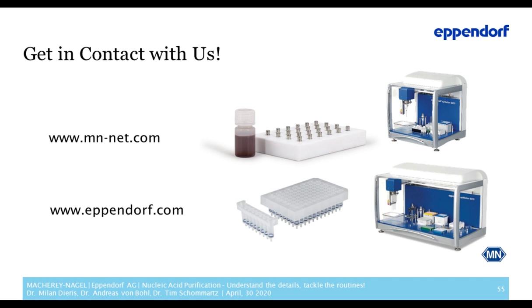Usually all lysis buffers from RNA kits are designed in a way that the RNA is protected in the buffer once the sample is lysed. Some kits also require the addition of a reducing agent like beta-mercaptoethanol to further inhibit RNase activity. The other option would be to put your sample into an RNA stabilization reagent. There are several of those commercially available, also from MACHEREY-NAGEL. You can go to our website and search for NucleoProtect. It is a reagent that infiltrates the sample and thereby protects the RNA from degradation. So these would be your options here.